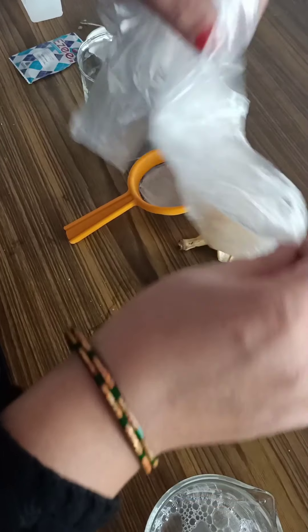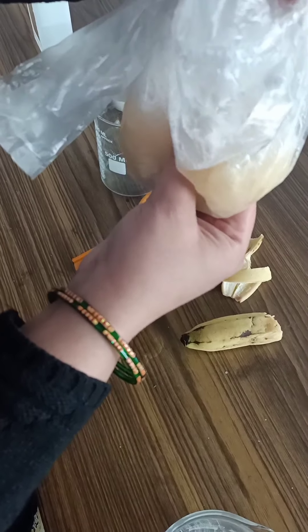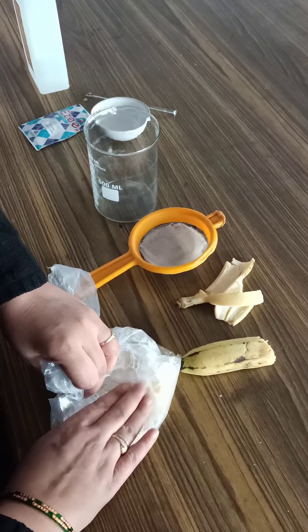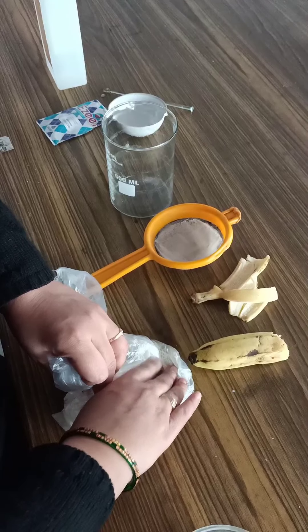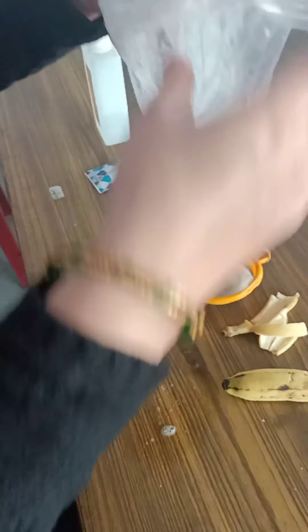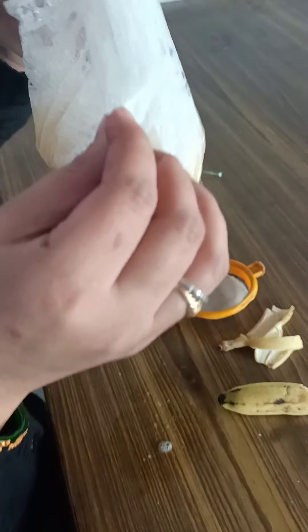Now, after stirring it properly and the salt and liquid detergent are mixed well, take the banana, peel it — you can take just half a banana and cut it with a knife, although we don't have a knife so we are using our hands. Remove the peel and place the banana inside the poly bag.